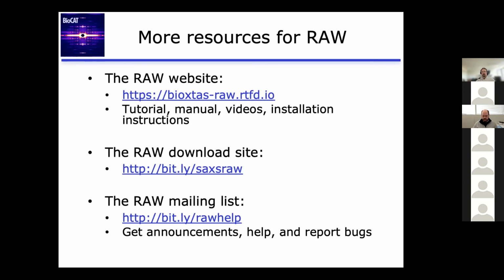So that's a very good question. I've worked with several groups at this point that have been using AlphaFold but don't have experimentally measured high resolution structures for their data sets. And so in several of those cases, what we've actually been able to do is use SAXS as a validation technique for the AlphaFold predicted structure, which then gives them confidence in carrying out their further analysis. So you can basically take the high resolution structure, predict the profile in solution, see if it matches what you measure. And if it does, then you have reasonable confidence in proceeding with AlphaFold.